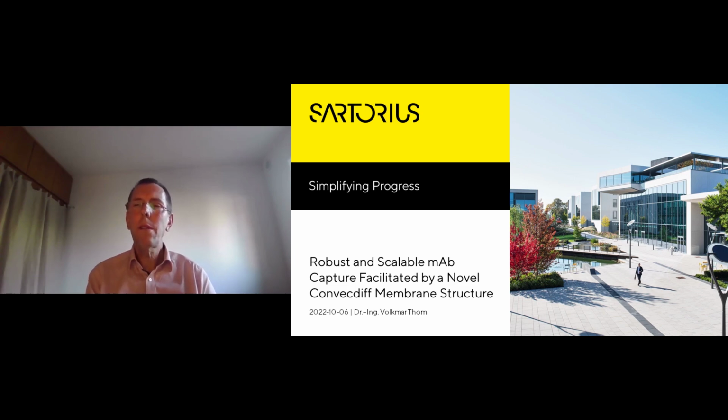However, you can use any chromatography system that generates the right flow rate. The only drawback is that a typical resin chromatography system that creates these kind of flow rates has typically also large dead volumes. And you know that the membrane that you use is much smaller than a resin column. And then the ratio between dead volume and column volume or membrane volume becomes a little bit disadvantageous for the dispersion. So it's not recommended to use a traditional chromatography system, but it can be done.